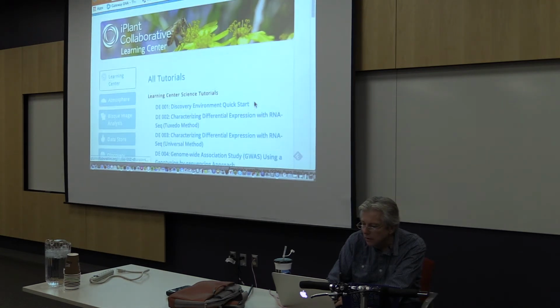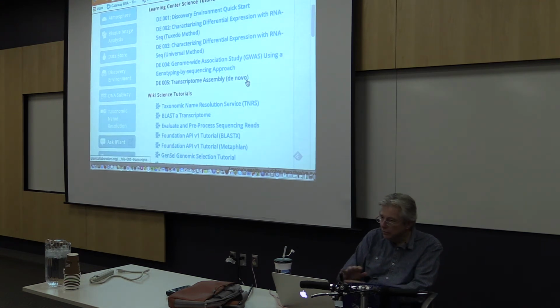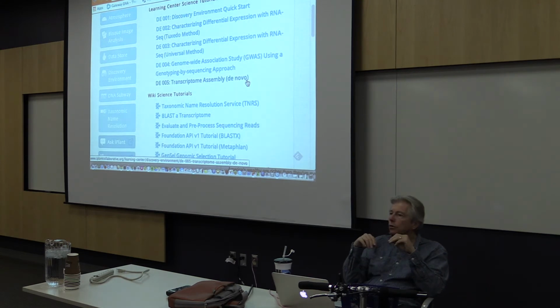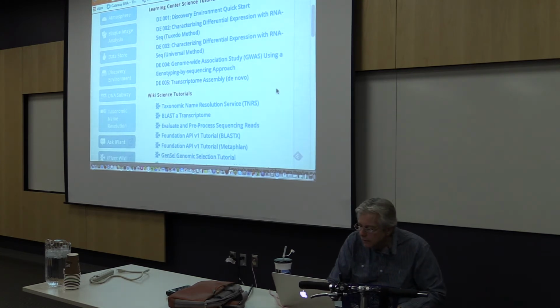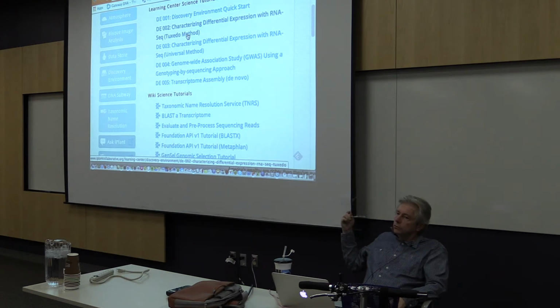Within this are the tutorials. You'll see a lot of tutorials, and these are really well laid out tutorials to follow. There's one for the tuxedo method. I recommend going through that to learn this method in more detail than I can do with you today.